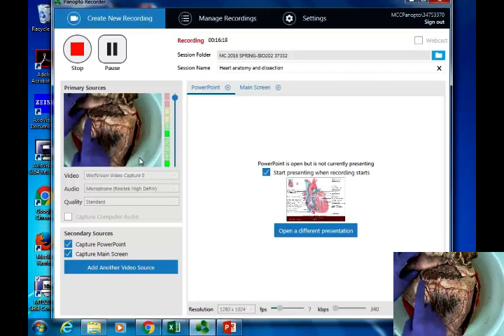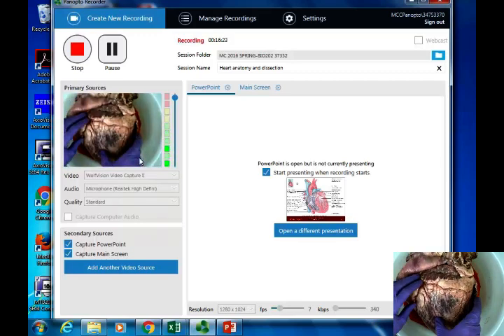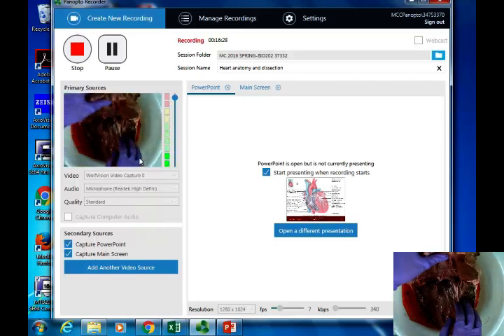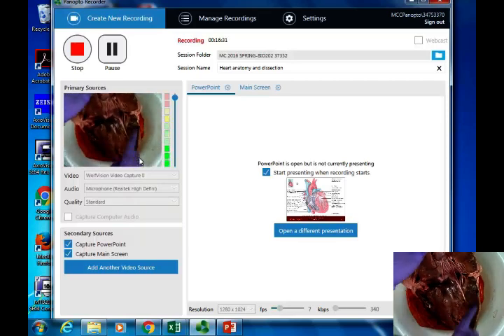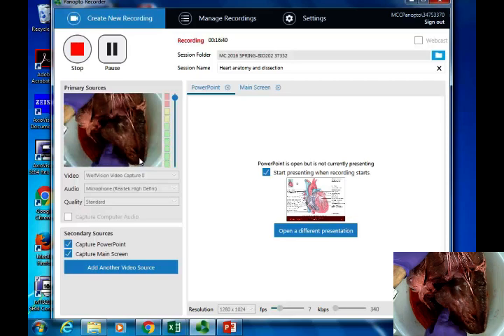Chambers as well as arteries. Arteries we find have a lot of elastic fibers in their wall so that they can distend and then go back to their original size. So if we look inside, oh, it's like opening a big mouth. So you can see the same. So here's a big thick wall here. So this is all left ventricle over here, okay? Right ventricle is going to be along this side over here, much thinner.